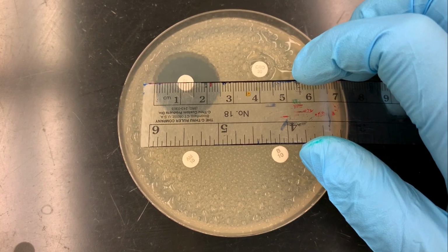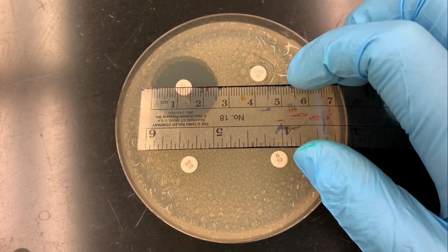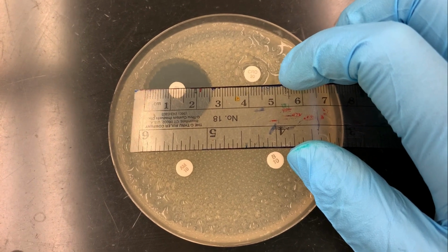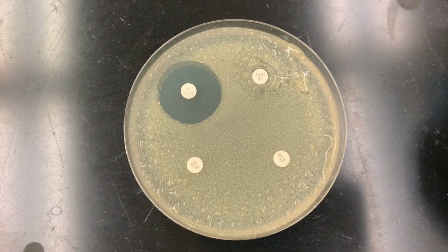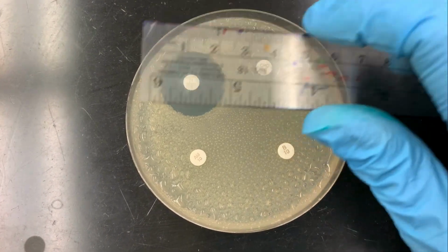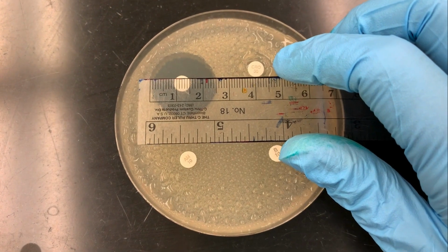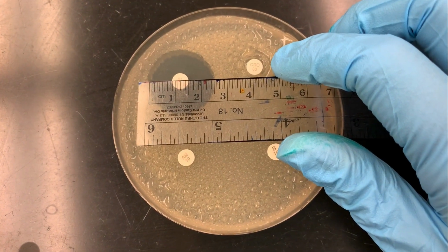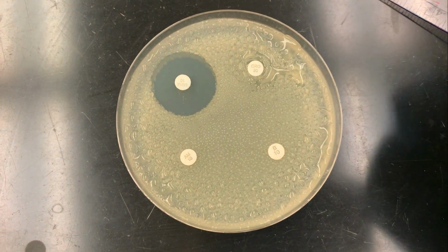I try to measure it at the widest part. I would say that the zone of inhibition to me looks to be about 25 or 26 millimeters. I'll measure it one more time, right? Measure once, you're in trouble. Measure twice before you cut. So we'll measure twice. Yeah, about 25 millimeters. I'm pretty comfortable with that.